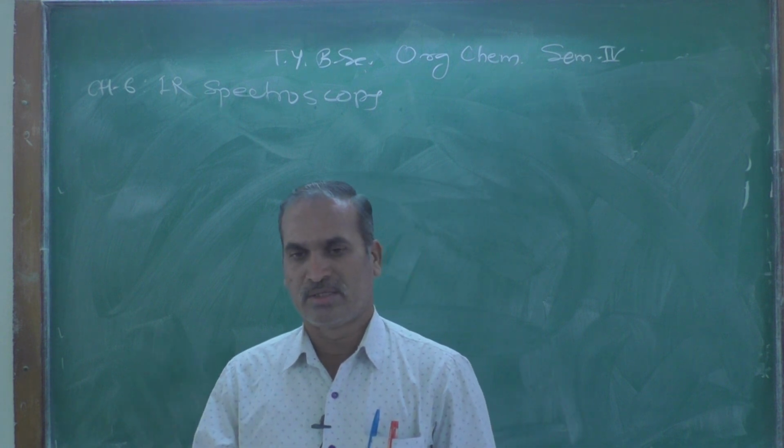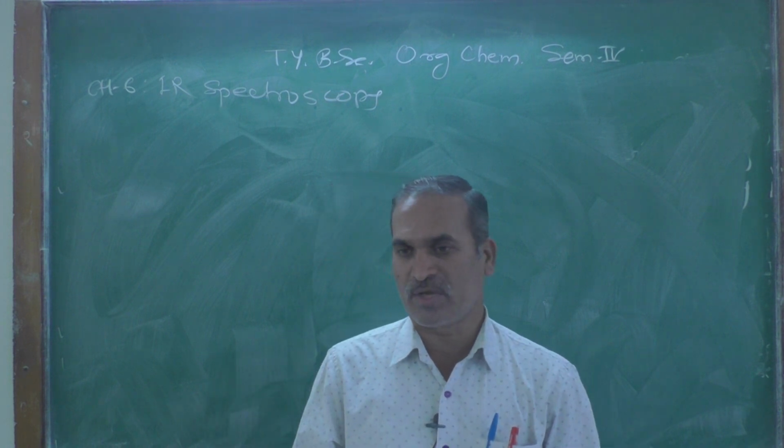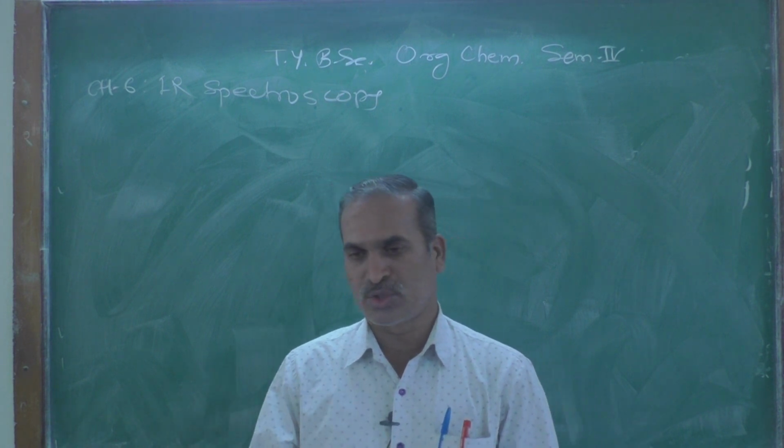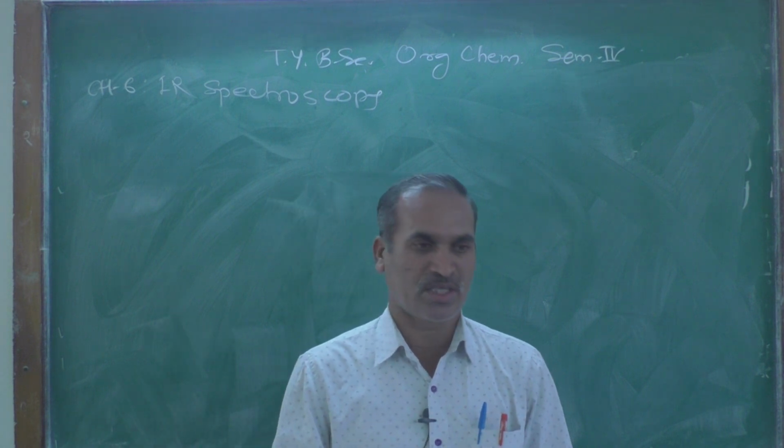mentioning the signal due to the OH stretching frequency, and another due to the CO stretching frequency.